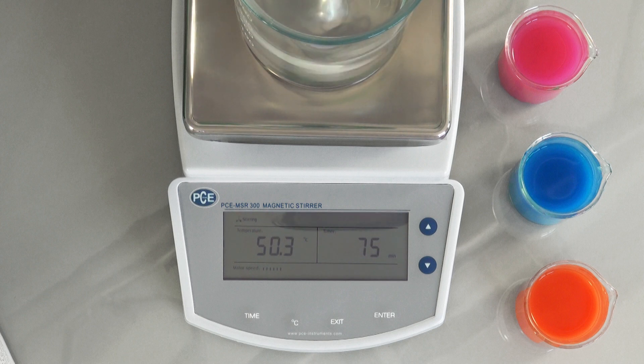Thanks to the heating plate, the probes can be heated up to 300 degrees. The heating capacity is 300 watts and is regulated with the external temperature sensor. To activate heating, press the degrees Celsius key on the Magnet Stirrer. On the left side of the display you have the possibility to set the degrees in 1-degree steps using the arrow keys.